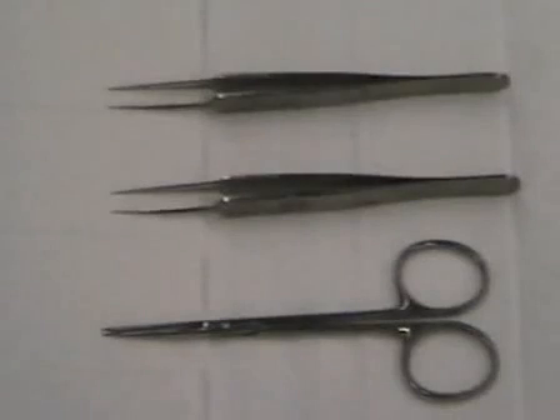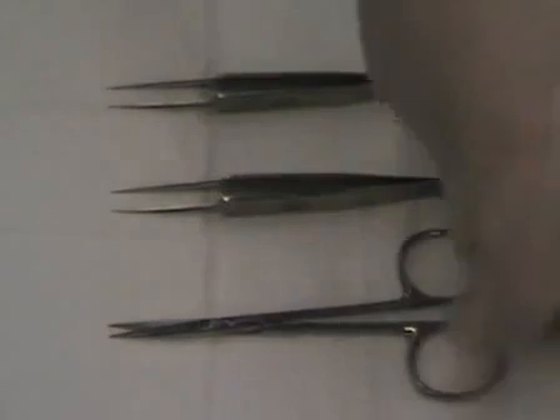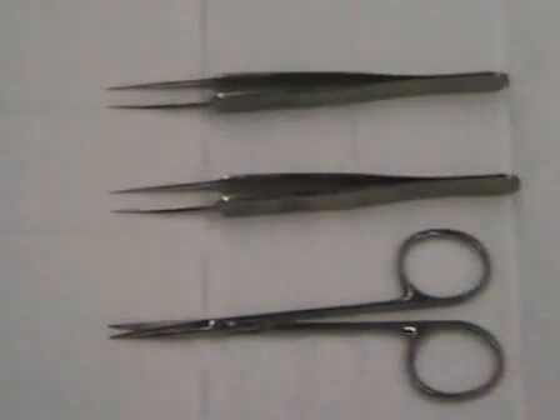The dissecting tools that we'll use are two sets of sharp forceps and one pair of sharp scissors. These will be used to isolate the vas deferens all the way through the testes and the fat pad. Once that's done, we'll be using the forceps to isolate the epididymis.